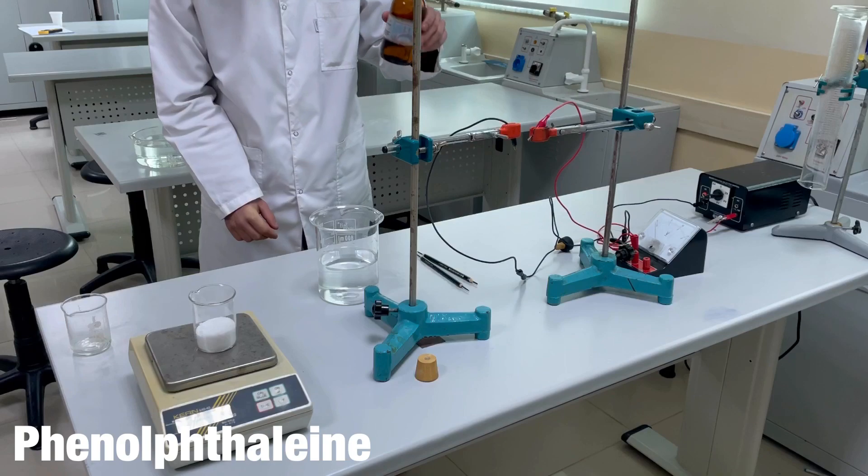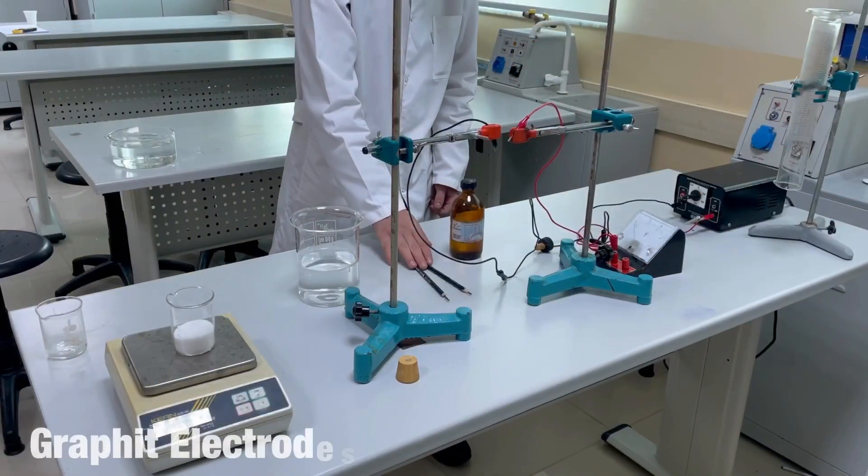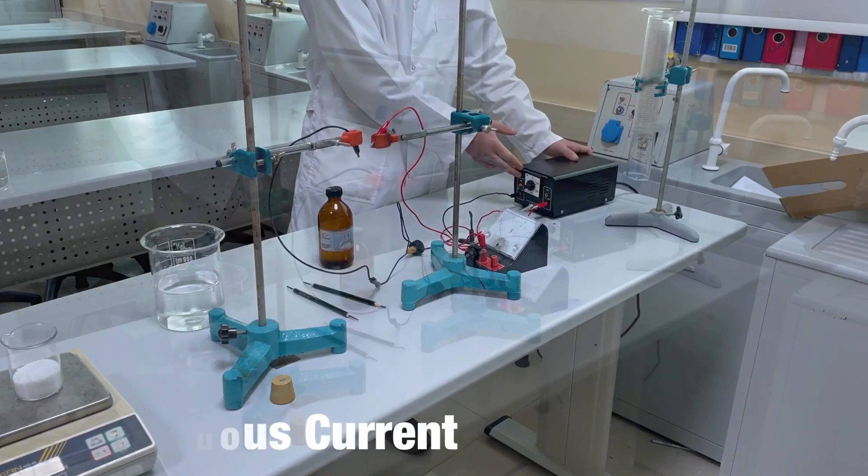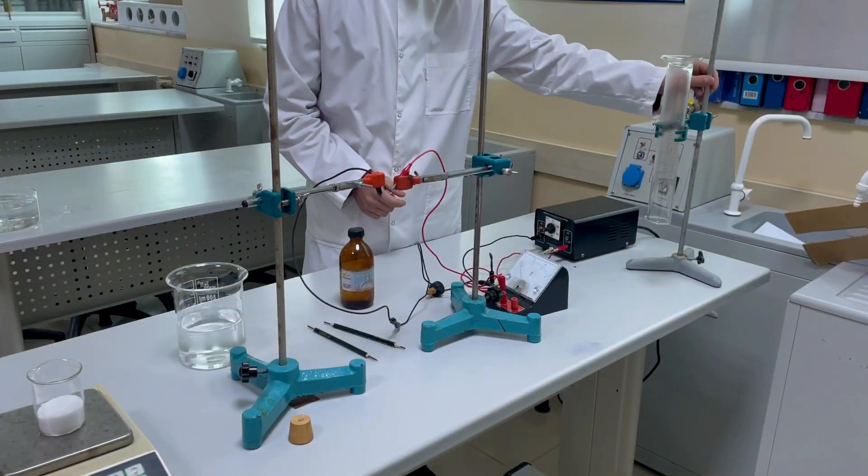We need the phenolphthalein indicator. We need 2 graphite electrodes. Also we need a continuous electricity supply. We will need a glass tube to collect hydrogen.